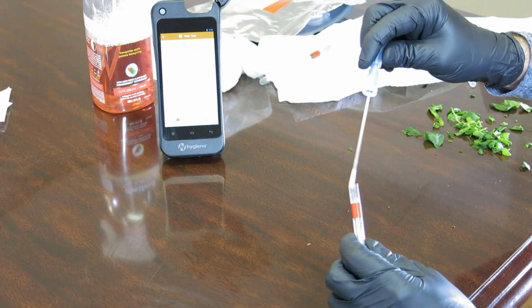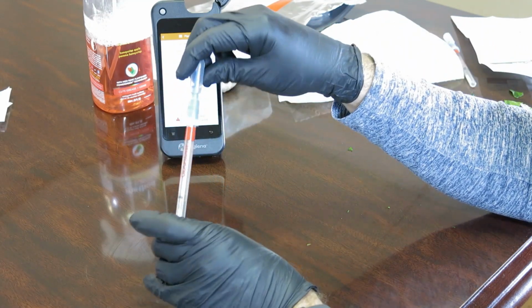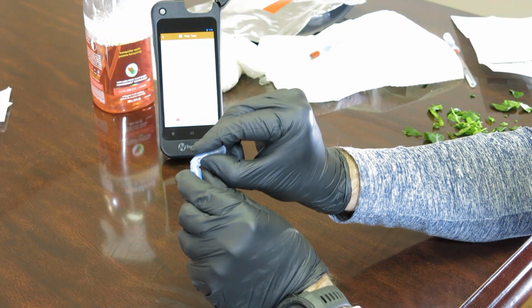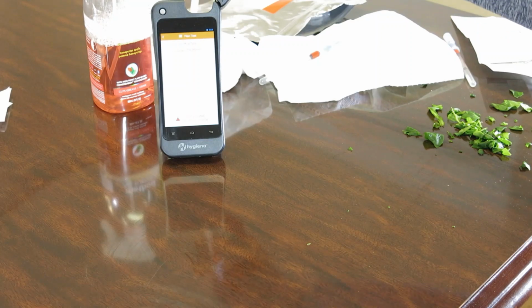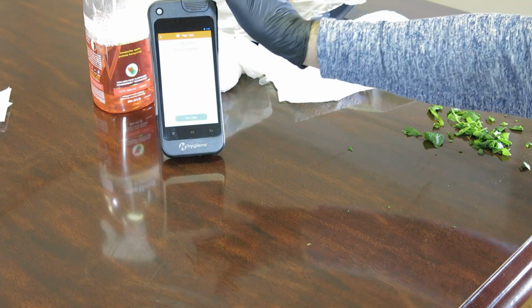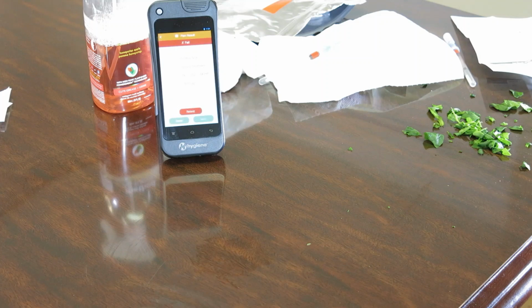I can actually see the green from the chloroplast on there. Let's break it again. Get that going in there. Okay, run this test. What do you think? 20,000? 10,700 RLUs. Okay, well, let's do a little cleaning and see what we can do with that.